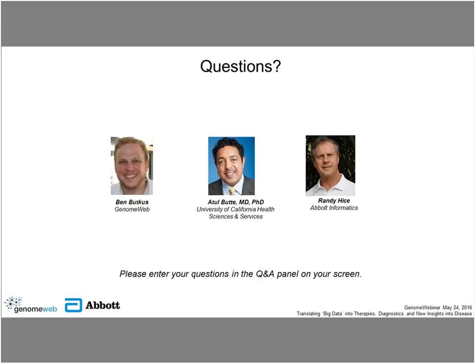Yeah, one way that we approach that is to make life easier by assigning roles to different users. So a role might be limited to a certain set of screens or functionality, so the initial splash screen they come into when they enter the product is just limited to the functions that they work with. So they don't have to sort through all these menu clicks to get down to where they need to be working. You can have multiple roles if you have both roles as a bench level analyst and also as a supervisor. You can have different sets of roles for those, so you see different functions, but it does tend to make the whole landscape a lot simpler to work with.